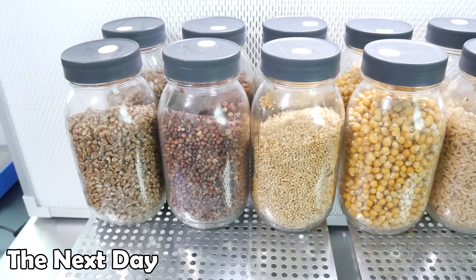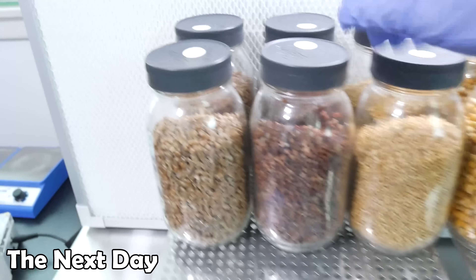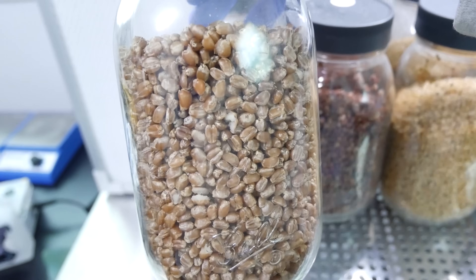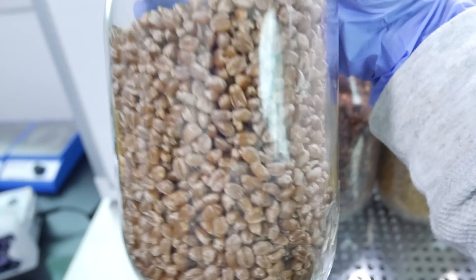After the jars are sterilized I let them cool overnight and they'll be ready to inoculate the next day. The first jar we have here is wheatgrass. I'm not too familiar with wheatgrass but they seem to be a suitable grain and they're abundant in certain areas so I added them into the experiment.